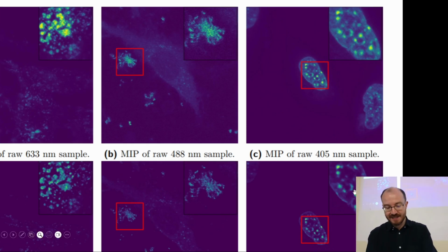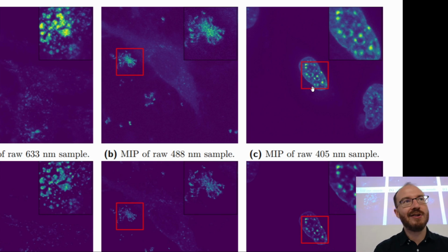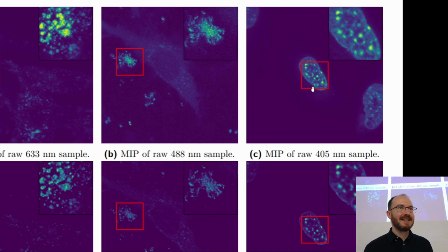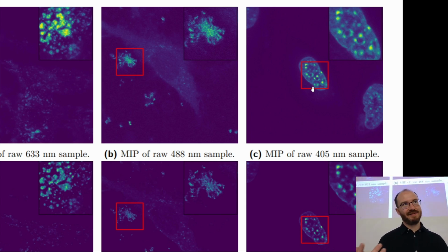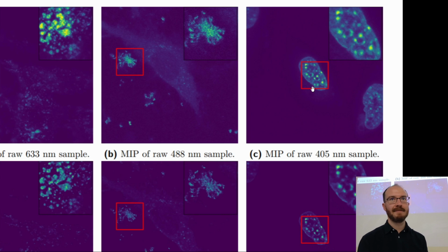And if you feel like, okay, this is actually a useful sample representative of what is actually going on under the microscope, then you analyze that and you compare results. You just need to be consistent, with everything being apples to apples comparisons. But if you feel like, okay, no, this neural network maybe didn't learn quite well enough what I needed it to learn, maybe I need to go back and deconvolve the samples manually, then I have a more mathematical process. It's maybe even more trusted by other academics because you can tell them exactly what you did. It's not this black box thing which they don't fully understand. So it's a trade-off. You get speed, you get pretty good results, but you maybe lack the mathematical rigor to explain how these results were generated.